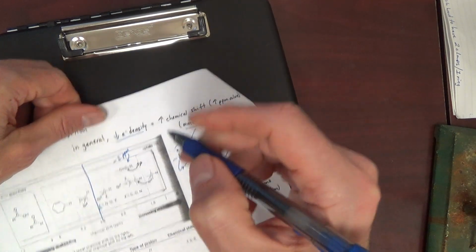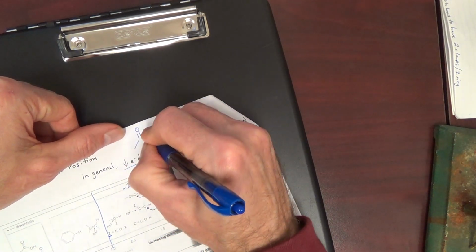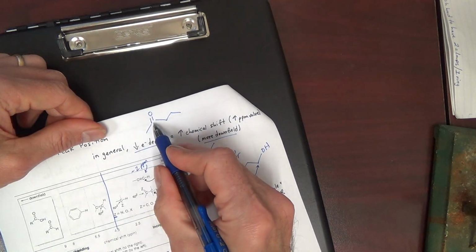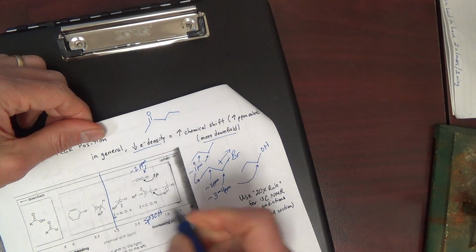This is showing still an sp3 CH, but next to a carbonyl. Now there's no hydrogen on this carbon. Again, this is sp3 CH land.